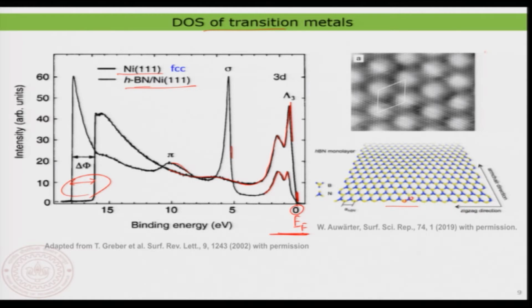So, you also have here an STM image just to show you how the microscopic structure of the boron nitride looks like. You can clearly see the moire pattern, but inside you can see tiny bright dots which also look like hexagons. That is clearly originating from the boron nitride mesh itself. So, these big ones are nothing but the moire pattern.